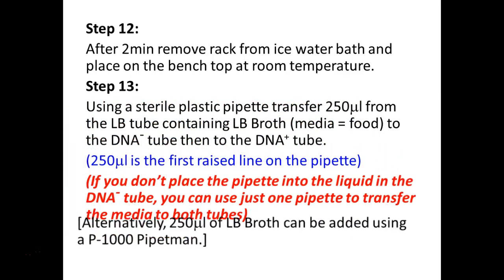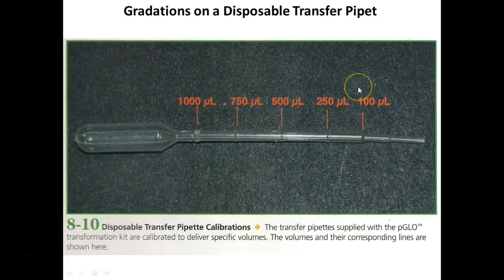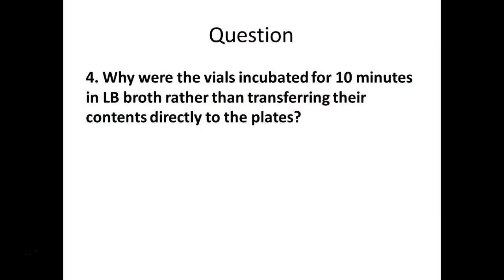We aren't going to use these pipetters because you guys don't do so well with them, and neither do I, right? Because you would have to draw up to right here on that plastic little pipette. You guys had trouble with 1 ml, never mind 250 microliters, right? So we're going to use the pipette men, which is much easier, right? And I'll refresh your memories on how to use that when we get to that step. Other classes used them last night, I noticed my stock is going down. Once we feed the vials, we're going to leave them for 10 minutes on our bench top before we put them on the plates, okay?